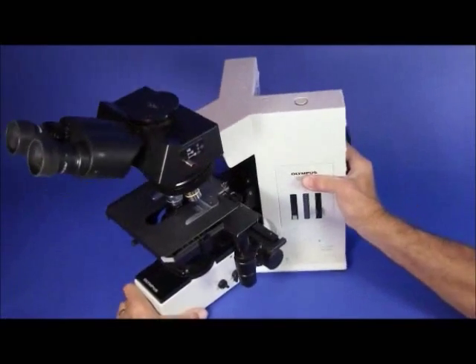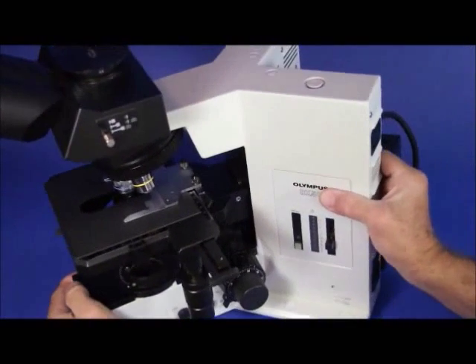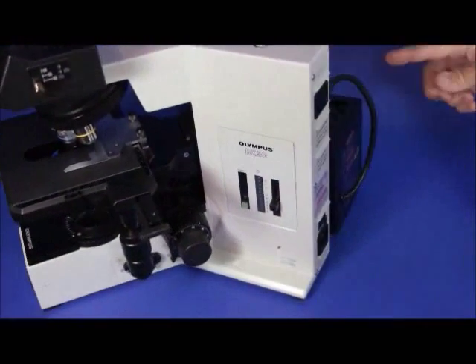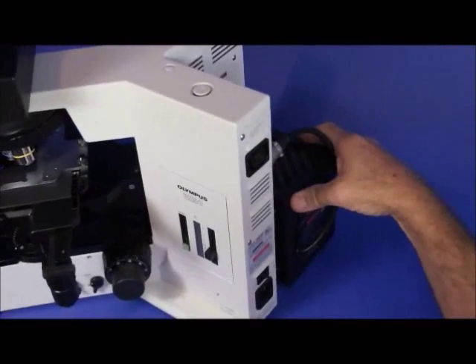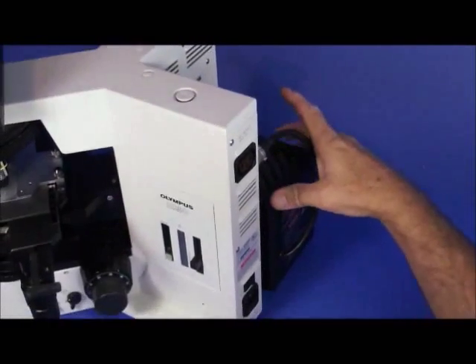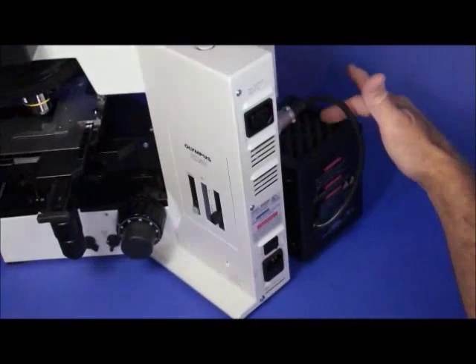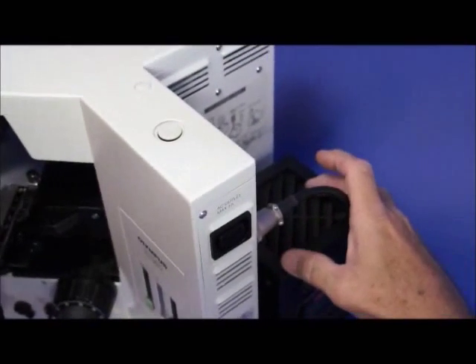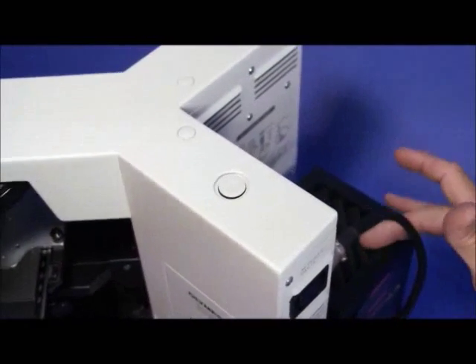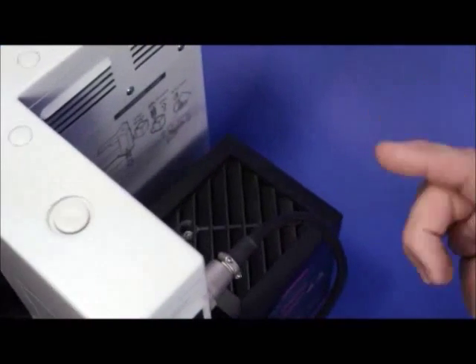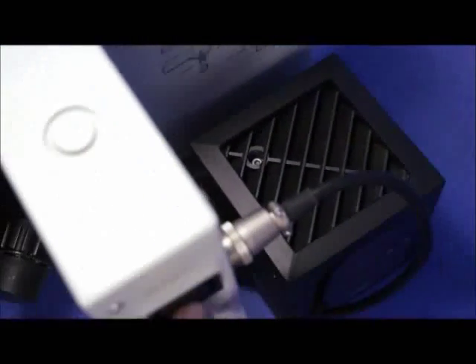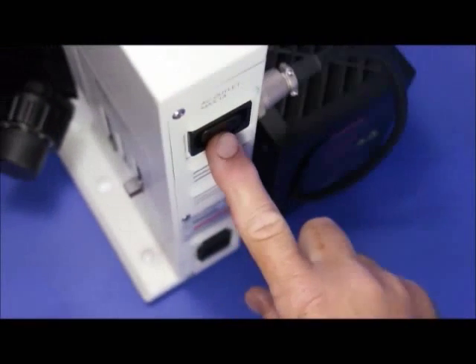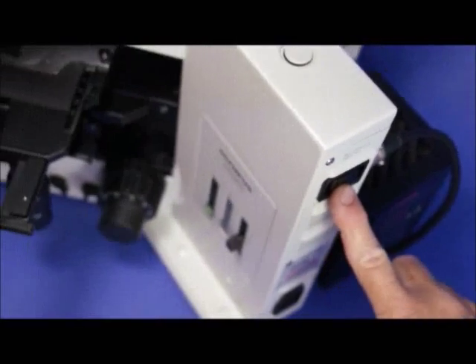Moving just a little bit to the rear, I want to show you this lamp housing. It's a 12 volt 100 watt lamp housing and it's very large and it's vented so that when it gets hot the heat can dissipate quickly.